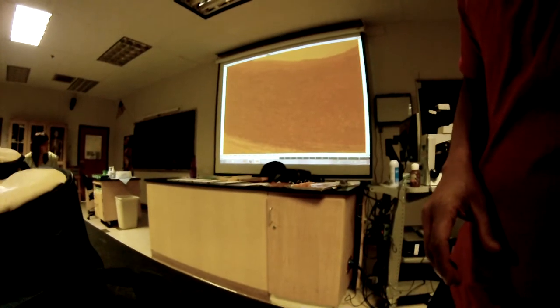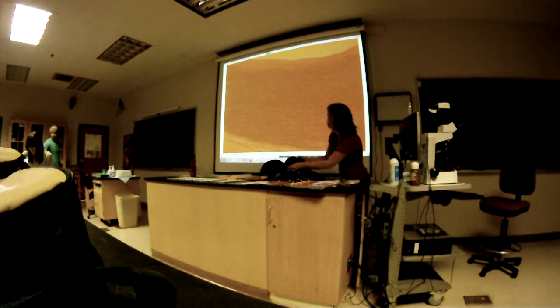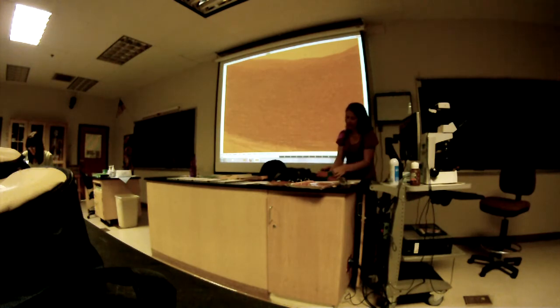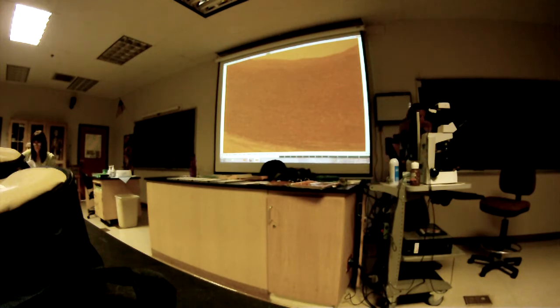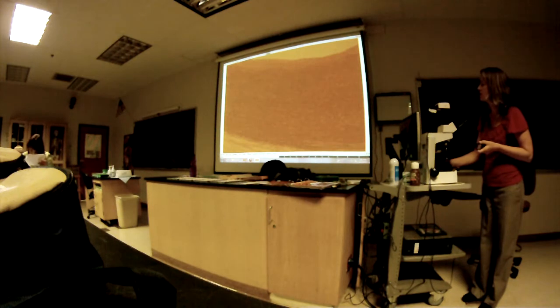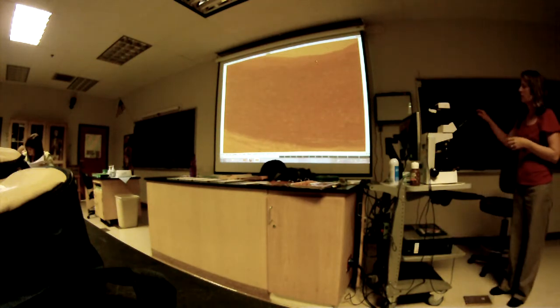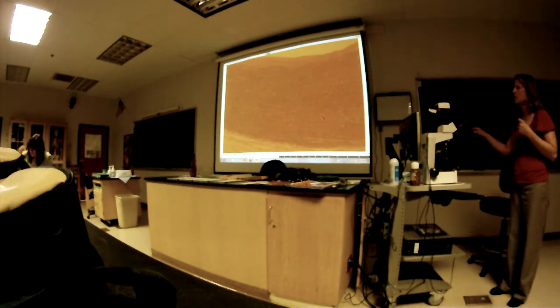So this is the aorta, the wall of the aorta. And what I wanted you to focus in on this slide, because the other main layers aren't very clear or a good representation, is the tunica media layer. A very thick layer of smooth muscle.